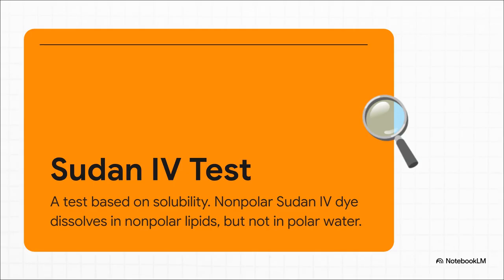This test works on a completely different idea, solubility. The rule of thumb in chemistry is "like dissolves like." Sudan IV dye is nonpolar, and so are lipids. Water, on the other hand, is polar.